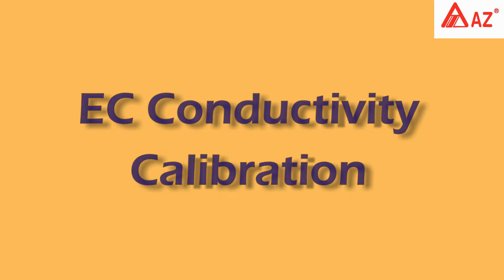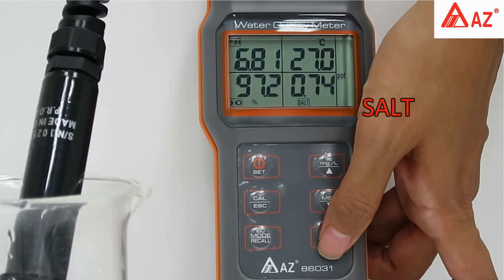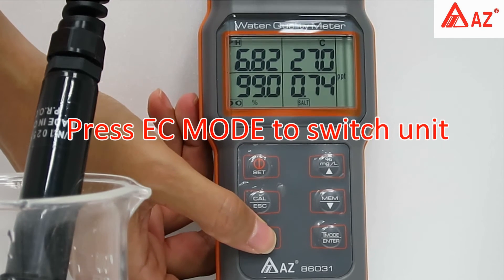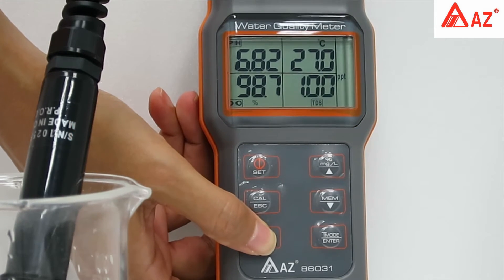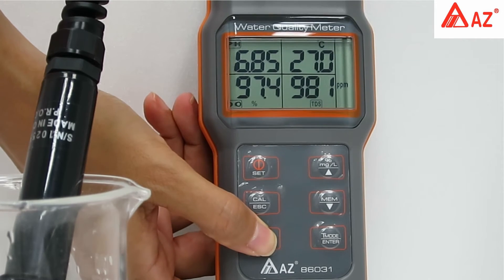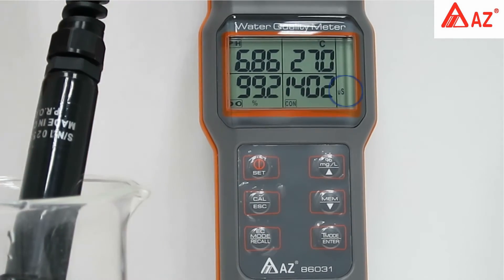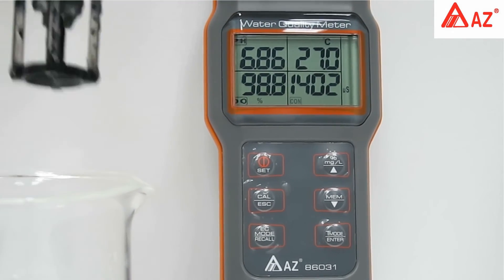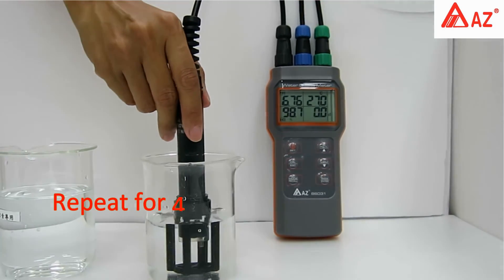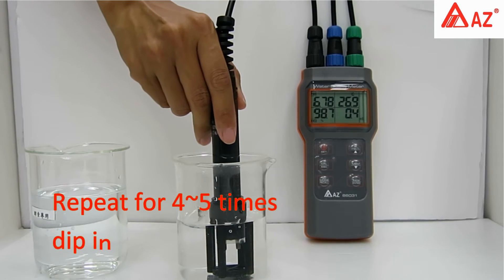Conductivity calibration: press the Mode key to switch to conductivity, then press the UC/Mode key to switch the unit to microsiemens. Repeat dipping in solution and swinging dry 4 to 5 times — this removes air bubbles which can result in inaccurate readings.